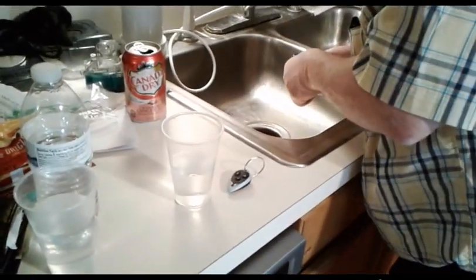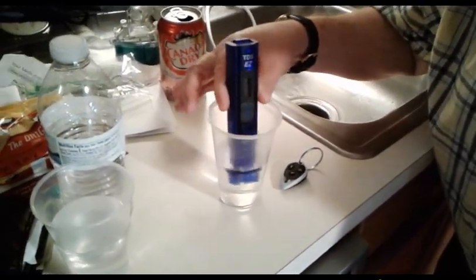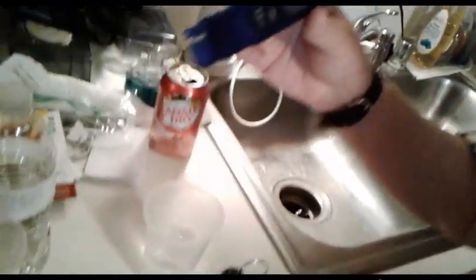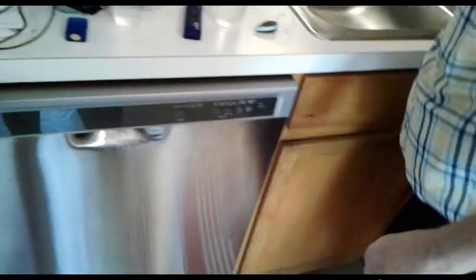This water's no good to drink from Sam's Club. Let's get the TDS on it. It's 202. The other water I want to test is the water that comes out of your filter, so I'll try that.